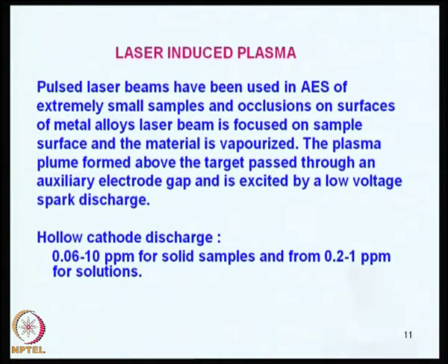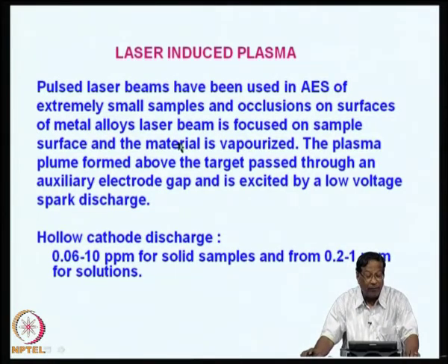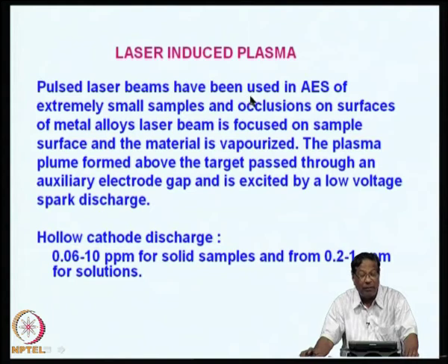In laser induced plasma, I want to show you in this slide that pulsed laser beams have also been used for atomic emission spectrometry of extremely small samples and occlusions on surfaces of metal alloys.